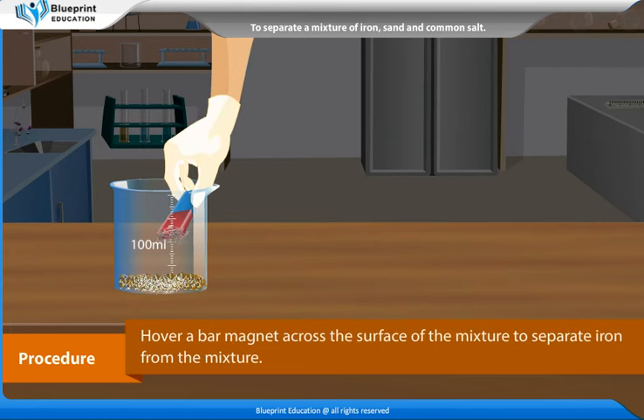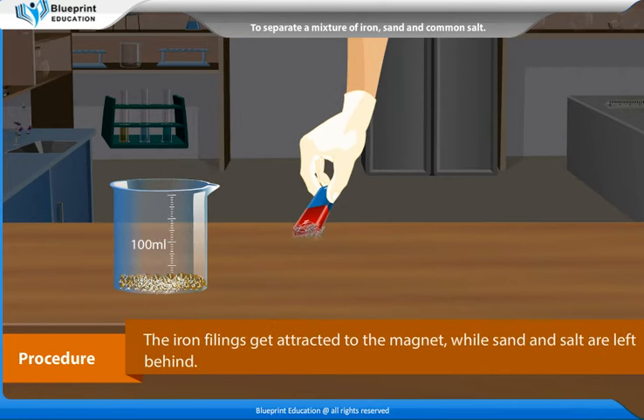Hover a bar magnet across the surface of the mixture to separate iron from the mixture. The iron fillings get attracted to the magnet, while sand and salt are left behind.